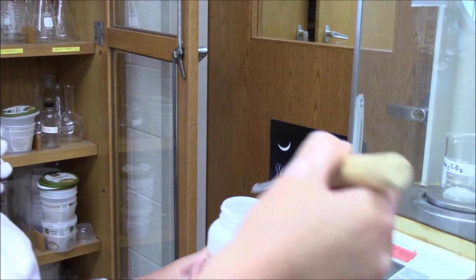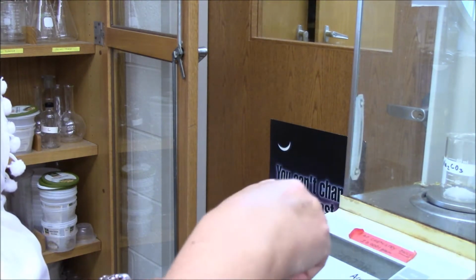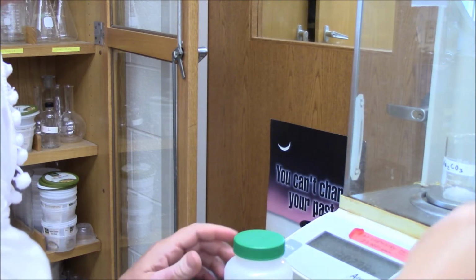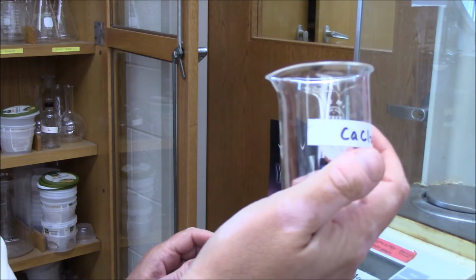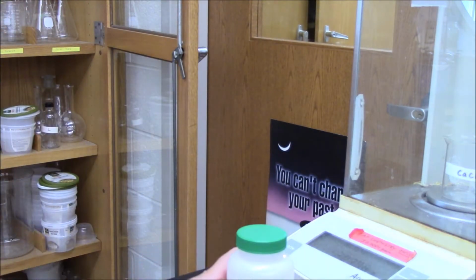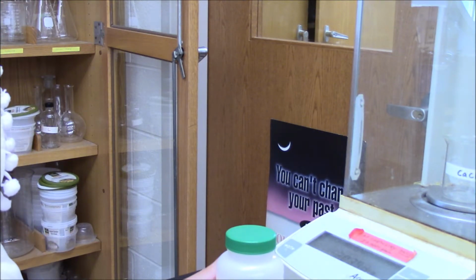Okay. 2 grams. In fact, it's 2.0238 grams, but that's neither here nor there because the instructions say we are weighing about 2 grams. The purpose here is to create a precipitate. I take my second beaker, which I've labeled as calcium chloride, and I'm going to add calcium chloride to it.